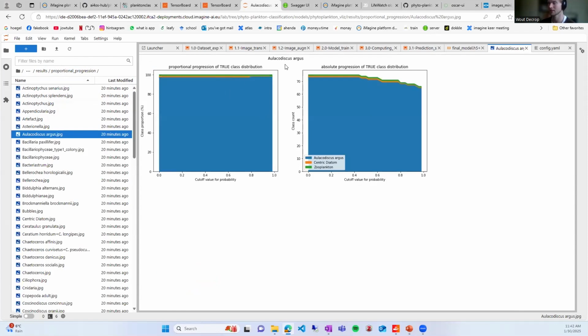You can see, for example, for this class, if you have the same training, you can assume that it's right because for all our training data, it has always been right, 99% of the time. But of course, if you want to check if it's right, you need somebody who knows the plankton species to confirm. For all of these, you can see it's confirmed, so it should be the same. But for non-annotated data, you can see how confident the model is. And this confidence should say something about the accuracy, but of course, it's not a one-to-one relationship. I hope that explains your question. You do need at the end a human to intervene for classes which the model is not confident about. If the model is confident, you can kind of trust it. Okay, thank you.